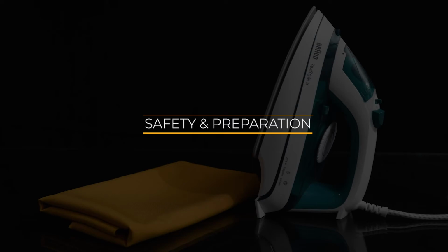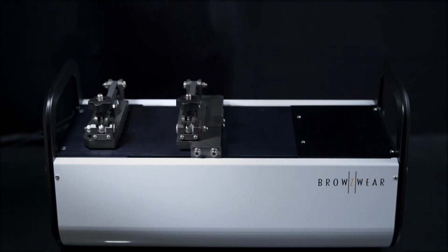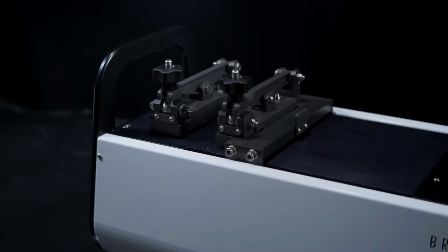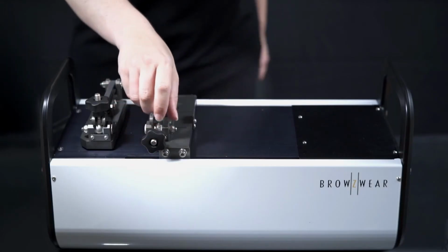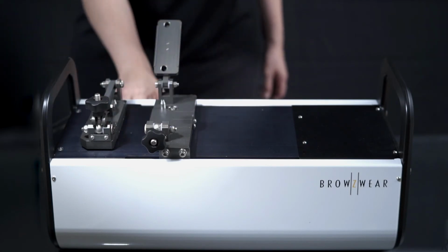Before we begin preparing the fabric and using the FAB, it's important to cover a few safety tips. When the FAB testing is in progress, be sure to keep your fingers and any other articles of clothing, jewelry, or hair clear of moving parts. Ensure that the fixed or stationary clamp is closed and the movable clamp is open for calibration.